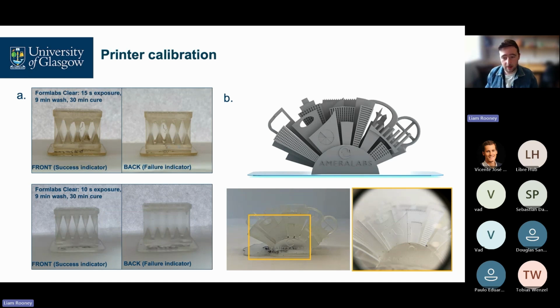In the general public, people who use 3D printers as part of their hobby have developed a whole suite of tools that are not particularly scientific, but they work very well for characterizing the performance of the 3D printer and calibrating the settings. So you can see here on the left at the top, these tests are called the cones of calibration, and it's two rows of teeth on one side and one row of teeth on the other side if it works perfectly.